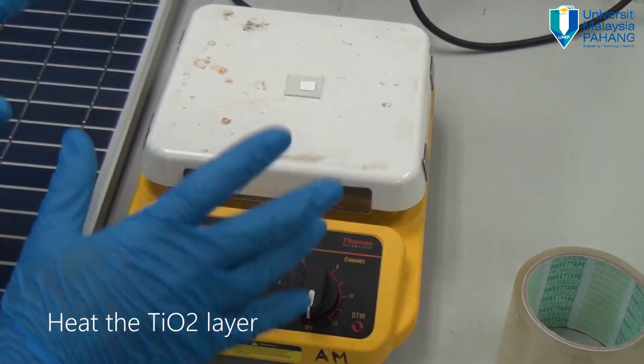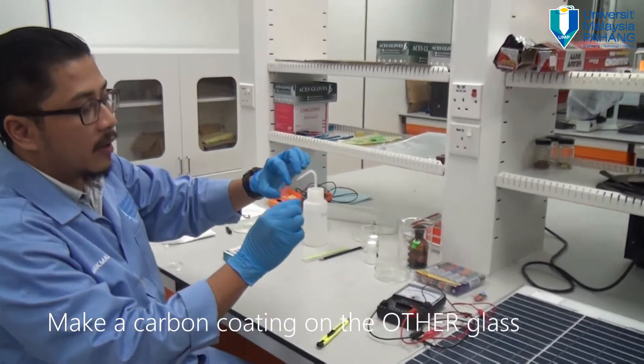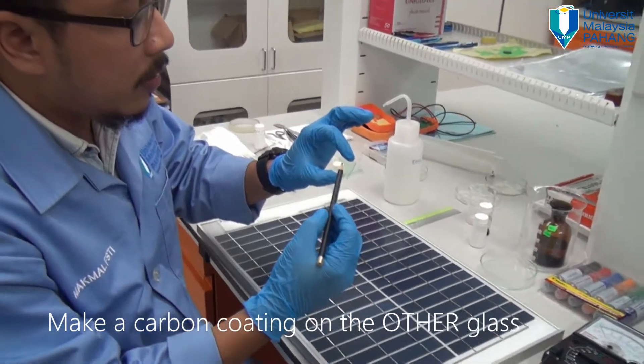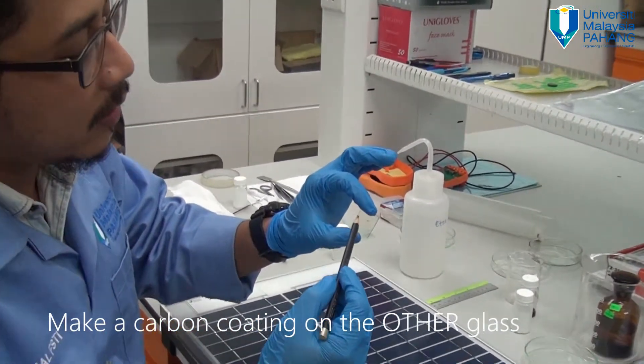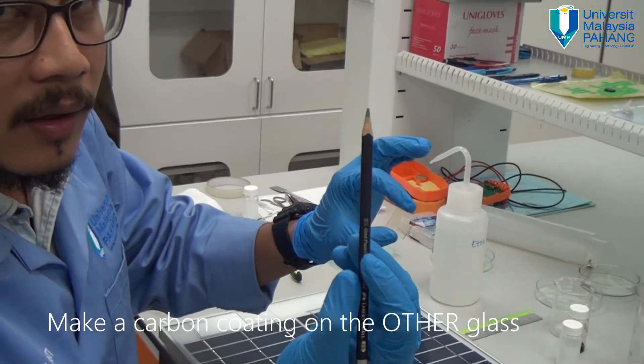Switch on the heating stage and set the temperature to 100 degrees Celsius for 10 minutes. On the other half of the conducting glass, take a pencil — we need to coat a sufficient thickness of carbon layer.